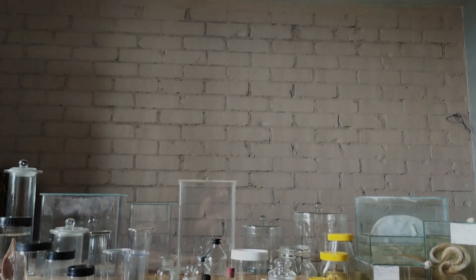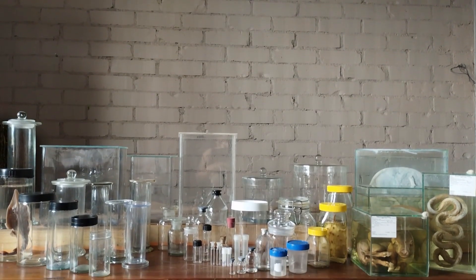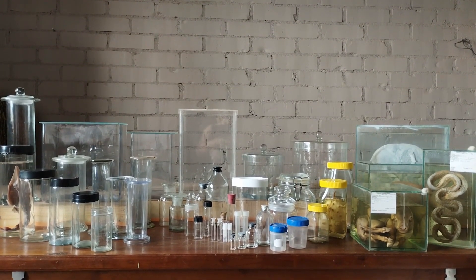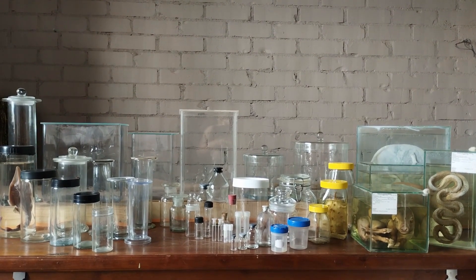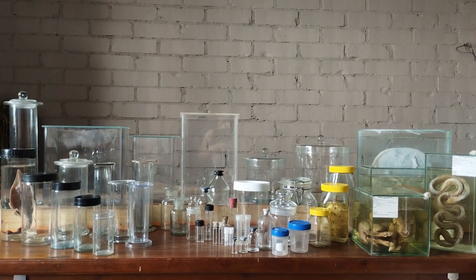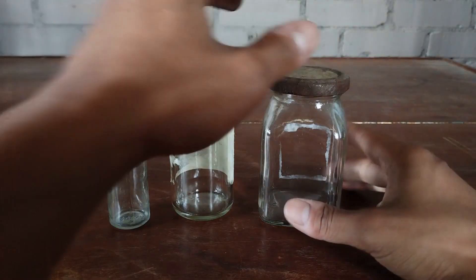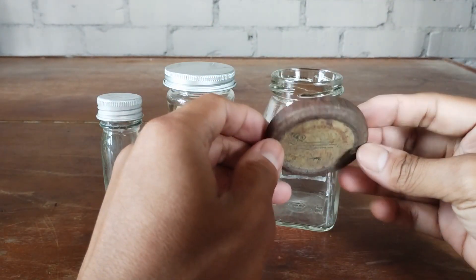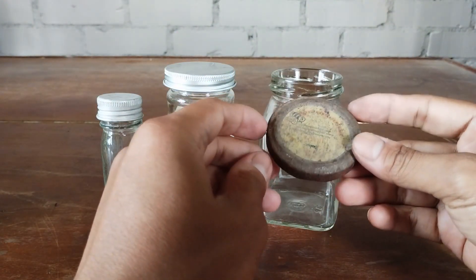Hello and welcome to a new video on wet specimens. In this episode we'll be primarily taking a look at the various types of containers recommended for storing wet specimens. I'll also discuss briefly about the containers that are not recommended for long-term specimen storage and the reasons behind why they fail to be effective containers.